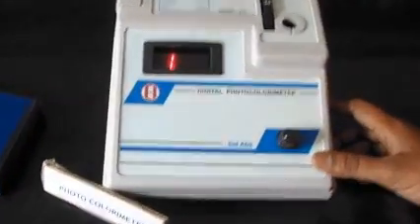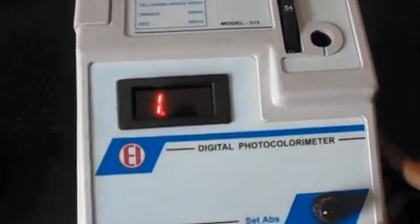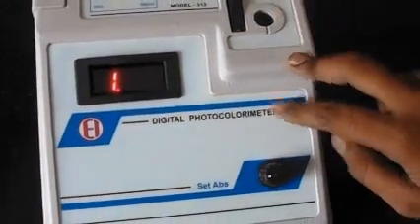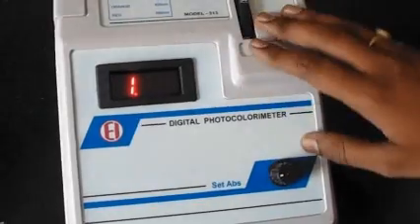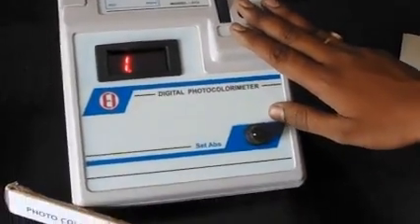Here we are looking at the digital photocolorimeter EIMAKE. This digital photocolorimeter is a compact and easy to operate instrument for colorimetric analysis of a solution of any concentration. Output is available on the digital display in terms of optical density, which we can also call absorbance. This is a unique system that combines convenience with accuracy and precision in analysis.